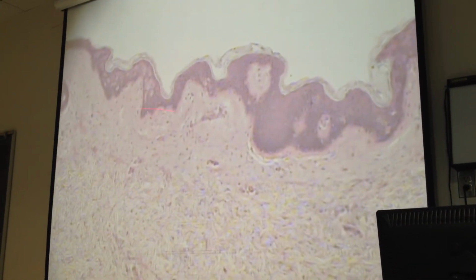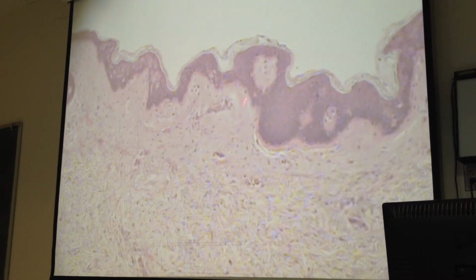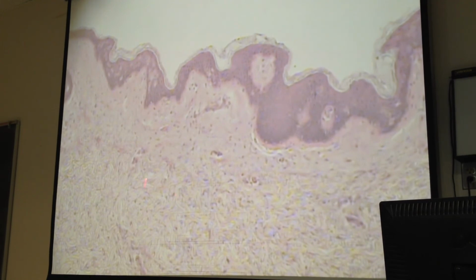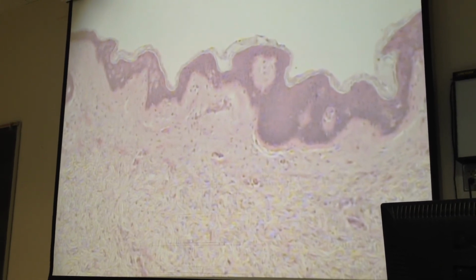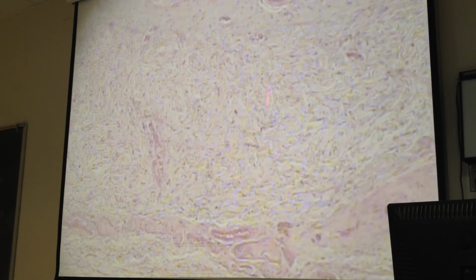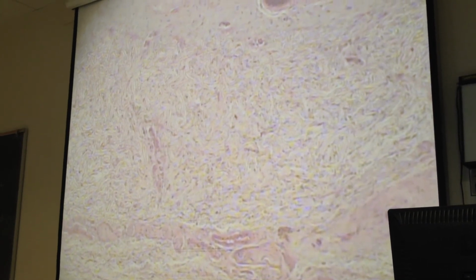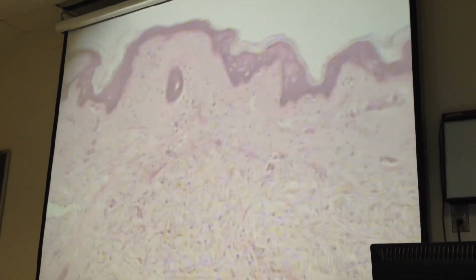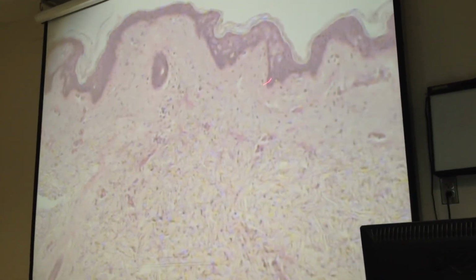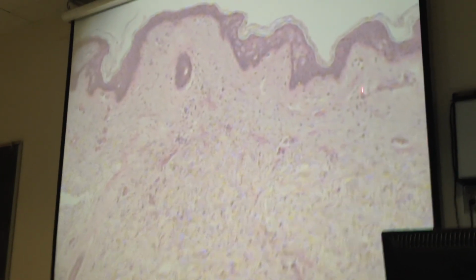And so what kind of tissue is the papillary layer comprised of? Do you remember that one? Areolar. Areolar tissue, good. And I just said it, but what kind of tissue is the reticular layer? Yeah, that dense irregular connective tissue. Good. There's the little hills in the dermis. What were the little hills in the dermis called? Yeah, papilla, dermal papilla. See, they go up, dermal papilla.